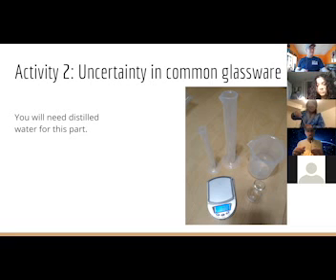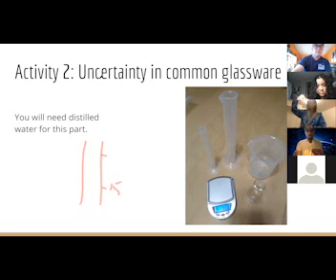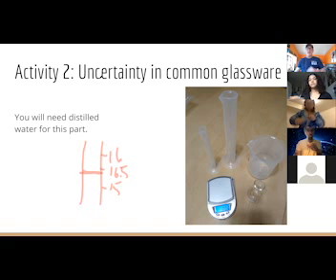And even if it is, it's kind of really hard to say exactly what the temperature is. So we need to do an estimate. So if this was, let's say, 15, 16, 16.5. So if my temperature was like about here, I then have to, 15.5, duh. I have to make a determination of what I think that temperature actually is.